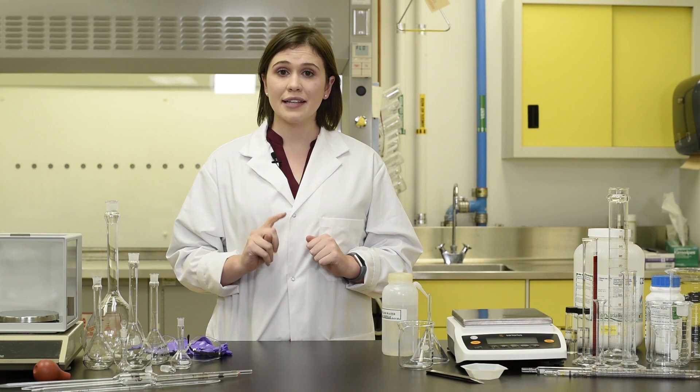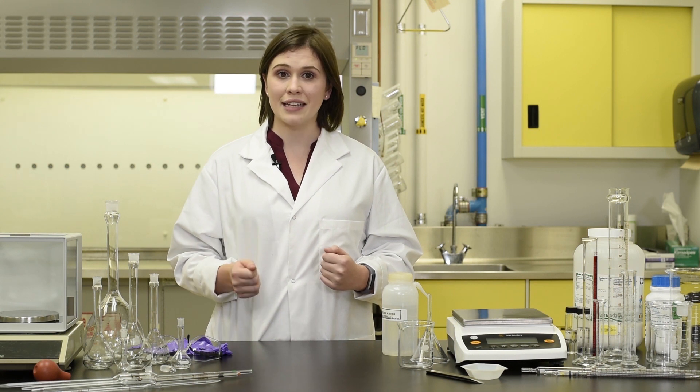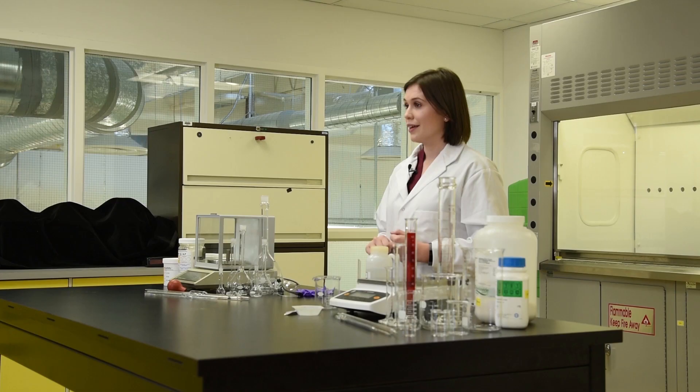Before making a solution, consider the degree of precision and accuracy required. Precision is how reproducible the concentrations are, whereas accuracy is how close the concentration is to the desired final value. Proper equipment is essential for preparing accurate and precise solutions.